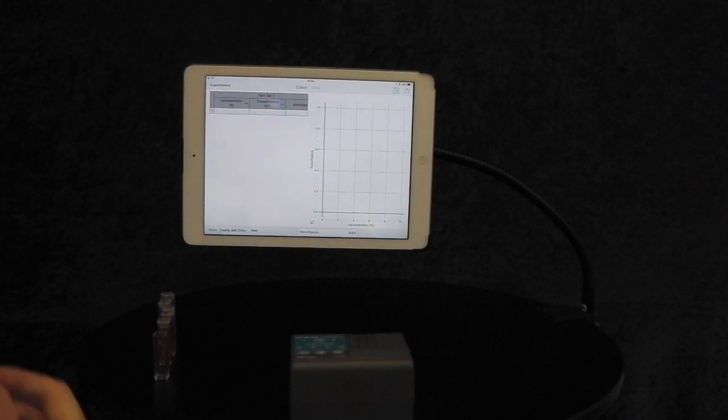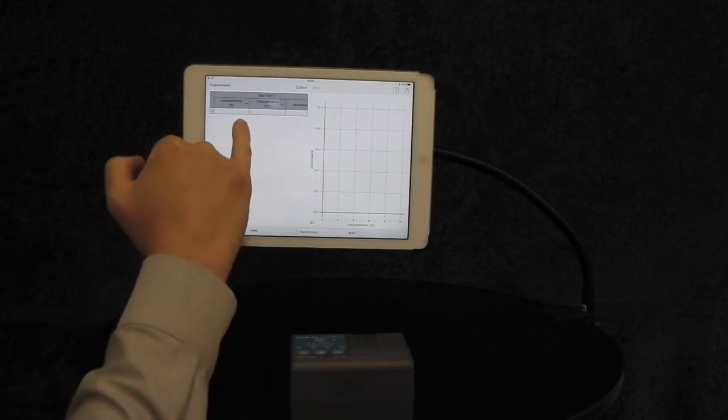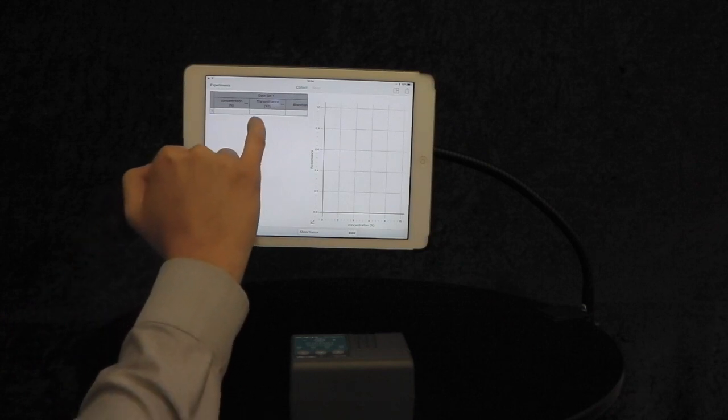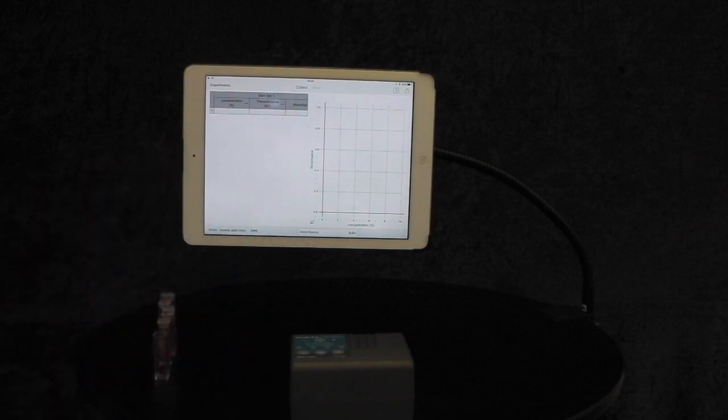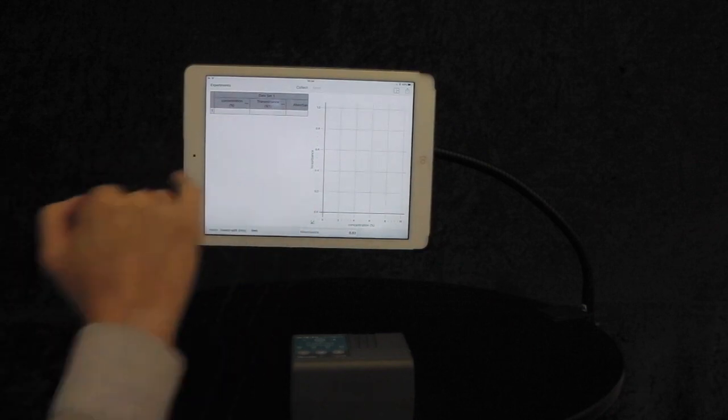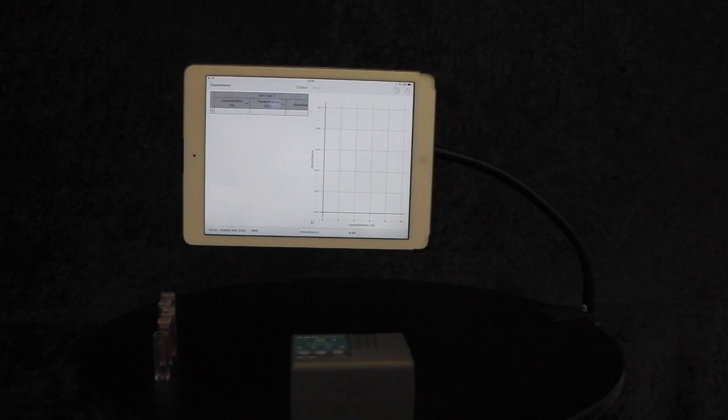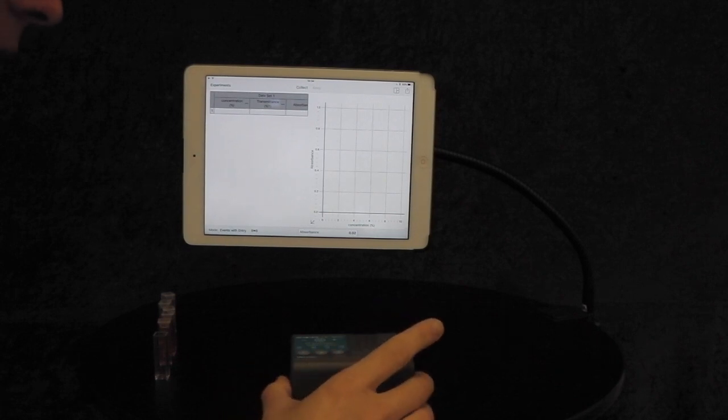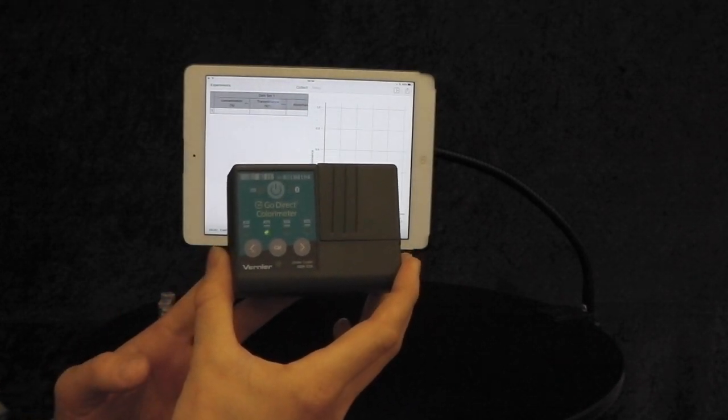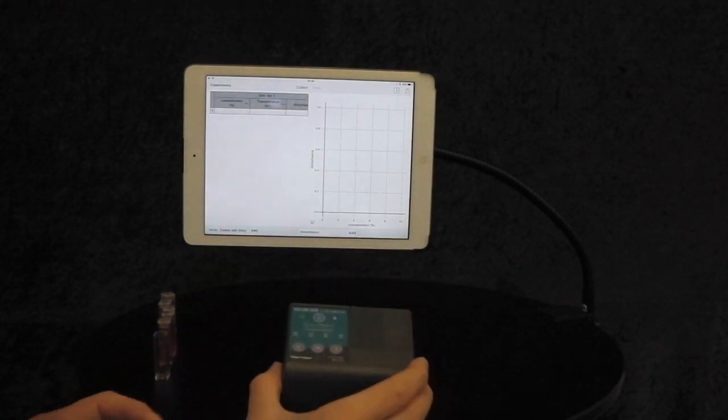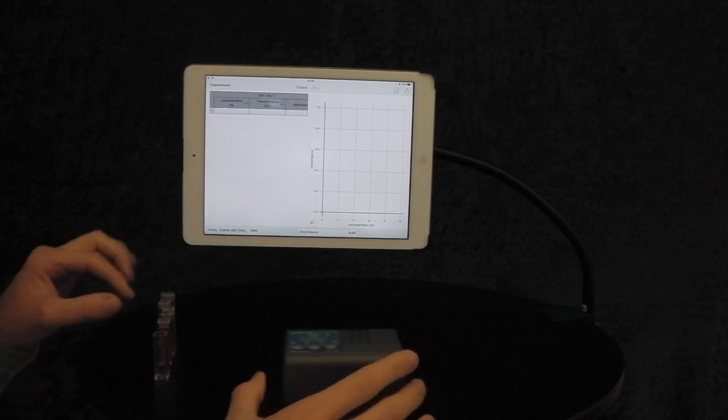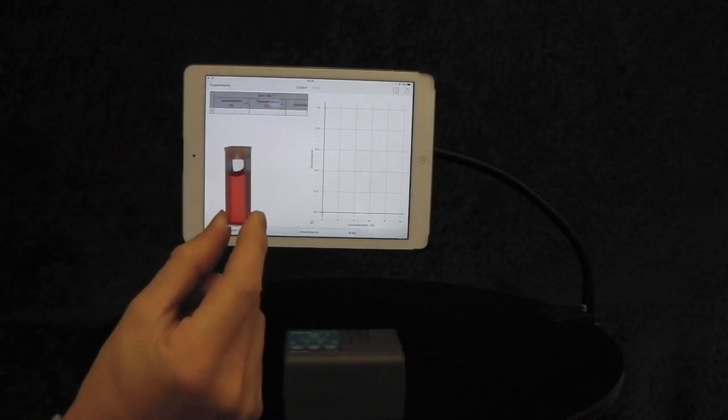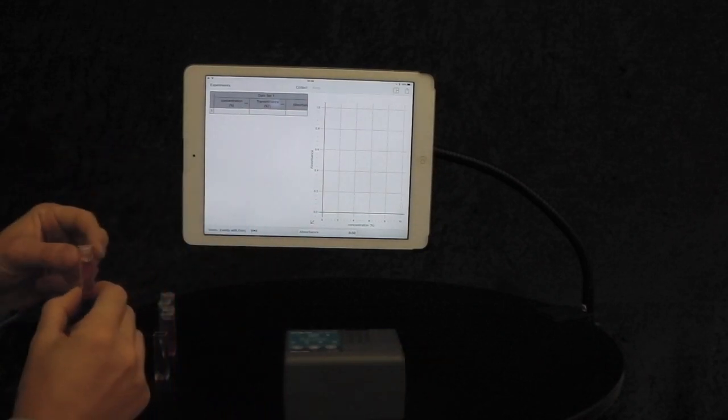We've now got a table of concentration, transmittance, absorbance, and a graph of absorbance versus concentration. I have selected the 470 nanometer wavelength, as I'm using some red food coloring for this experiment.